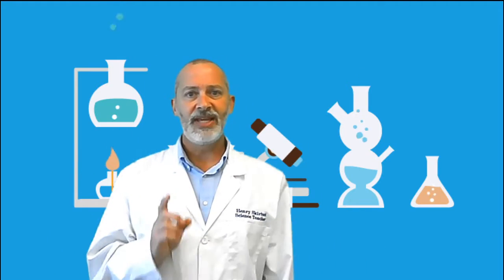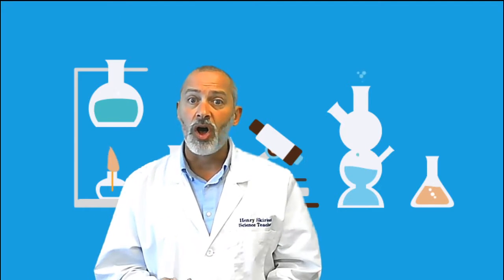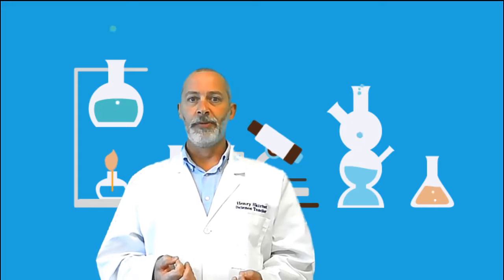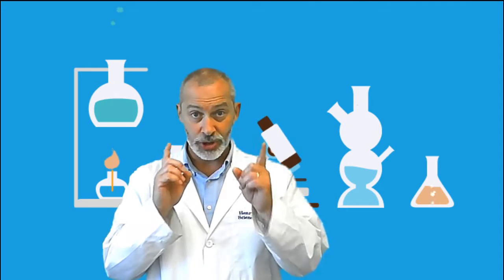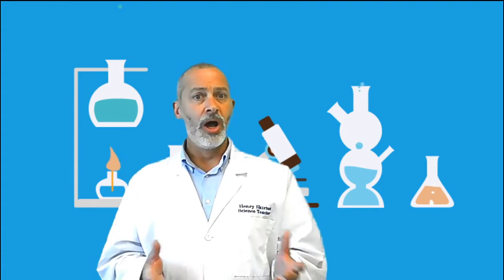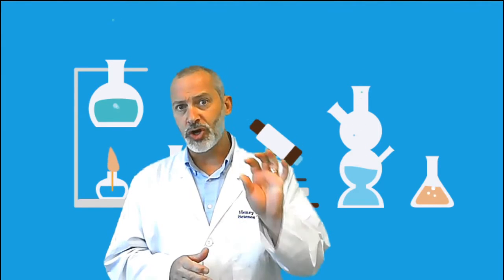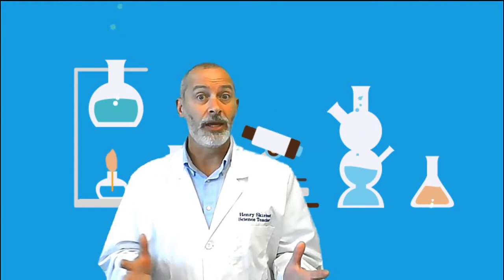One of your eyes tends to be stronger than the other, and that stronger eye is called your dominant eye. You need to determine which of your two eyes is dominant, because it's that eye, whichever one it is, that you're going to use to look into the microscope. Now, some of you may know, if you are a hunter, maybe you are familiar with which eye you use through a scope, perhaps, to determine the best chances of bagging the big game.